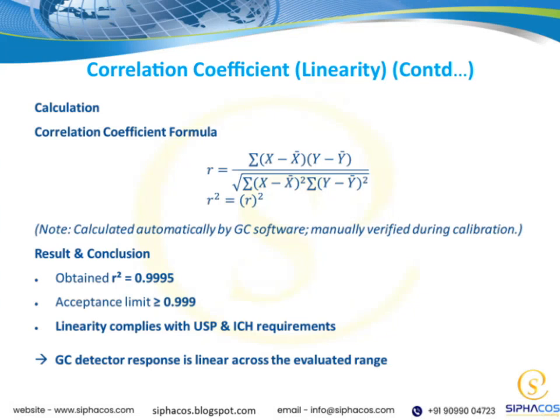Let's continue our discussion on the correlation coefficient and linearity. On this slide, we're focusing on the ongoing aspects of correlation, emphasizing that understanding the strength and direction of a relationship is crucial. The correlation coefficient helps us measure how closely two variables are related in a linear fashion. Remember, a value close to +1 indicates a strong positive linear relationship, while a value near -1 suggests a strong negative linear relationship. Values around 0 imply little to no linear association.